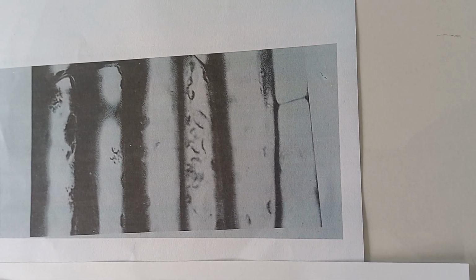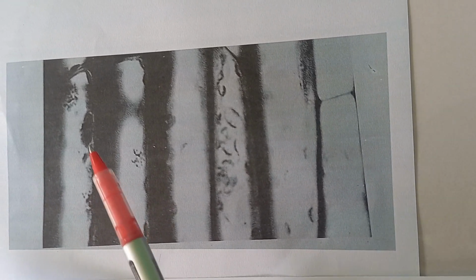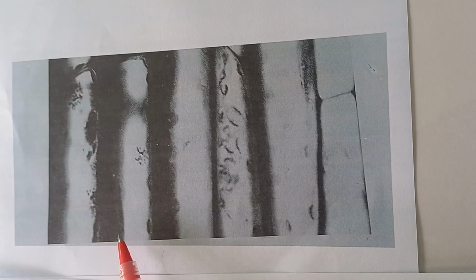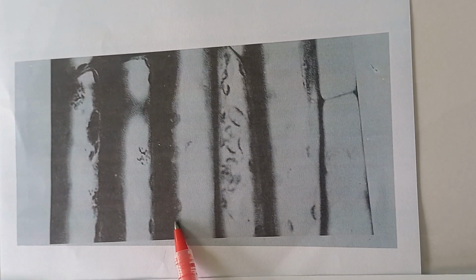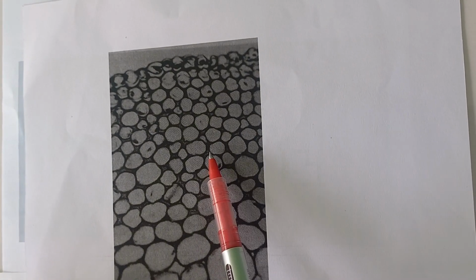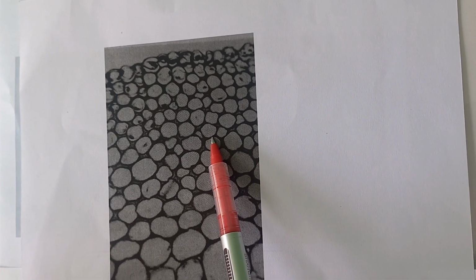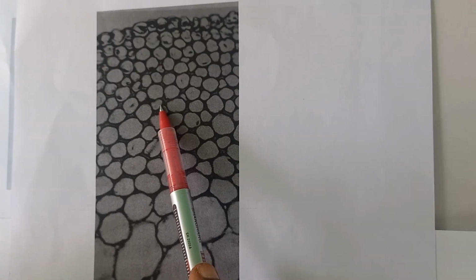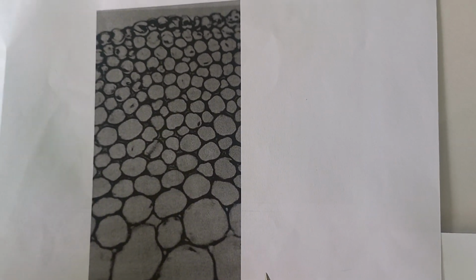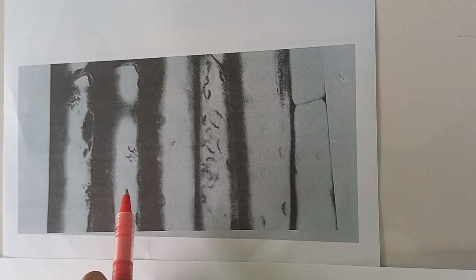The radial walls are thickened while the other sides of the walls are not. As we have here, we have thickening here. This is an LS, not thickened, not thickened. The TS also is the TS. These parts of the cells are thickened. Here is not thickened, not thickened, thickened, not thickened. That is a Collenchyma cell. So let's see how to make the LS like this one.